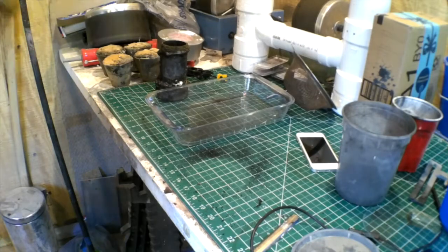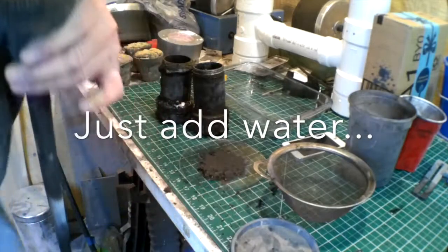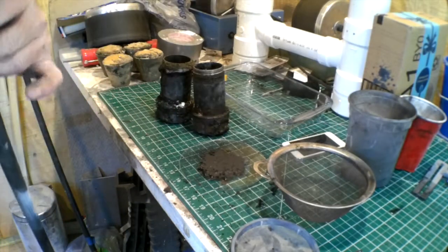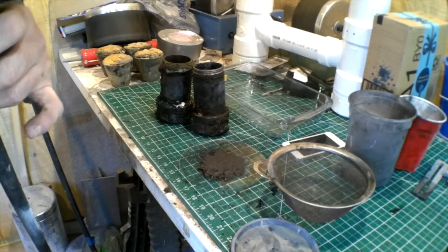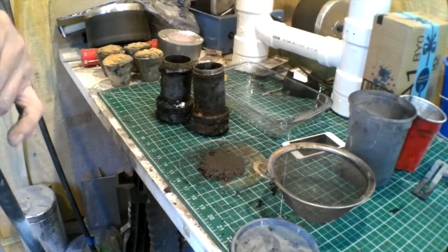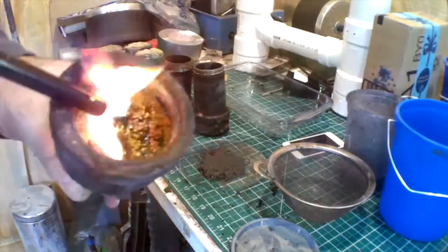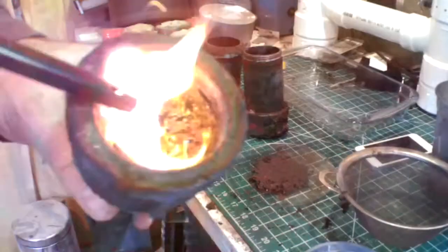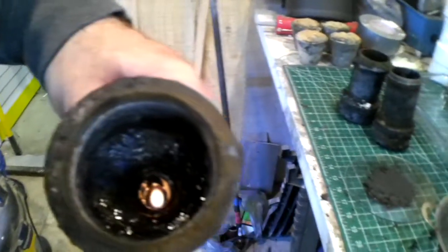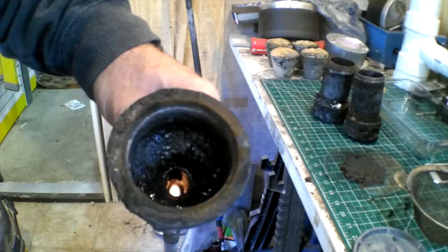Let's open up the potassium vessel. Maybe. I don't know if I can get it open. See, there's something in there that's hissing. Hear that? There may be potassium metal in there, but I just haven't figured out how to recover it in sufficient quantity. I just don't know what else would make that sound. If that's potassium metal, I've got hydrogen gas coming out. Yep. Look at that. I had potassium metal. It's still burning in there. See that? So I did produce potassium metal. I just wasn't able to isolate it.